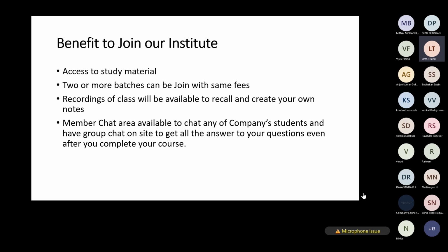JavaScript is for developing web pages. You use JavaScript and CSS in LabWare LIMS as well for creating the workflows. Workflows means web view pages, right? In your workflows, you see the icons, so they use JavaScript. That's a separate topic. It's similar, but it's easy. If you know the function names and what each function is used for, it's not comparable with JavaScript. But if you compare the LIMS scripting language, LIMS basic code, with Java, LIMS basic code is easier than Java. This is what I can tell you.